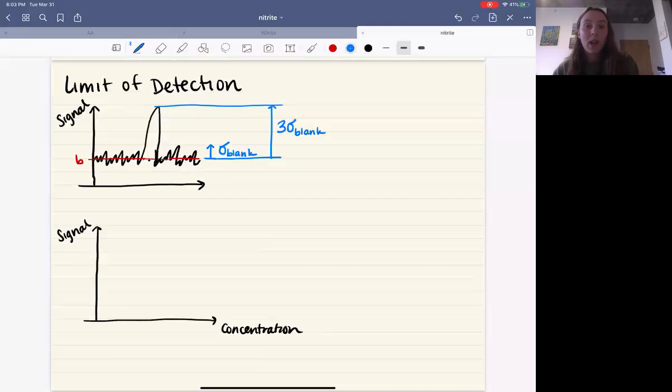Now, also, if you do a calibration curve, that is something to take into account too. So when you ran your blank, where does that land on your calibration curve? On the y-axis. You haven't added any standard solution to your solution yet, and so it's on the y-axis and you get some reading B. Okay, that y-intercept on this plot. And then you have your series of standards. Maybe you get data points that look something like this, and you draw a trend line between them.